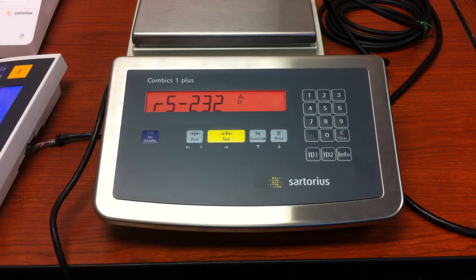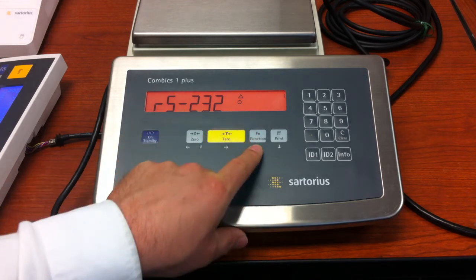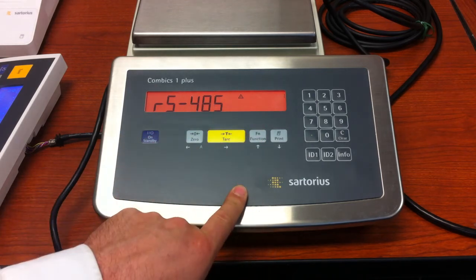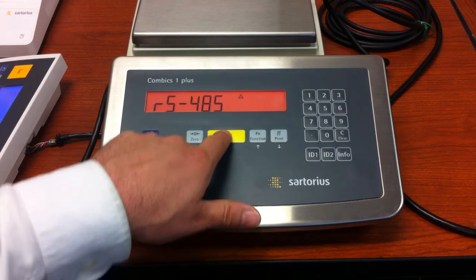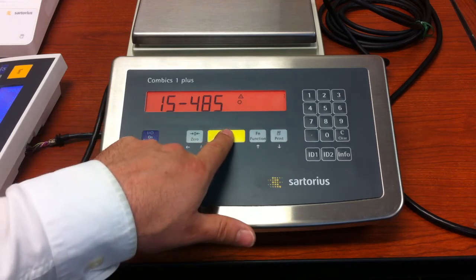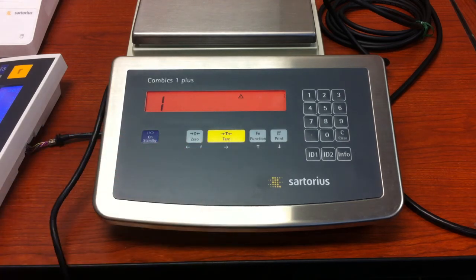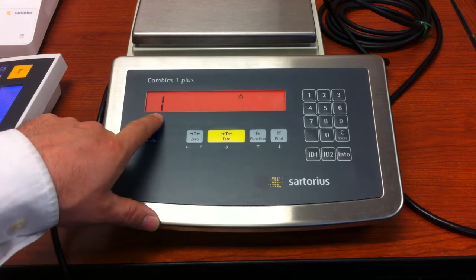This should be set for RS-485, but it looks like it's set for RS-232, and that is wrong. So we need to press and release the function key to get to RS-485, then press and release the tare key. It will then become IS-485 — press the tare key again and the correction has been made.